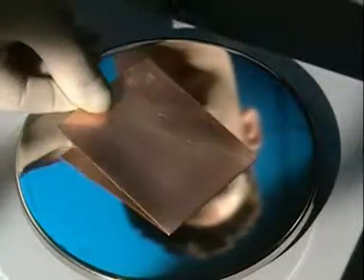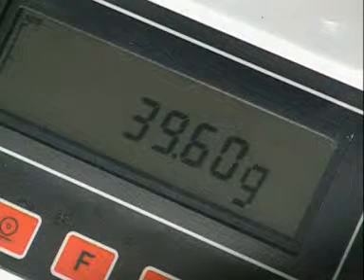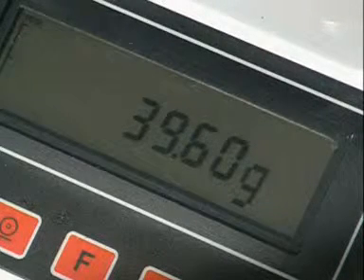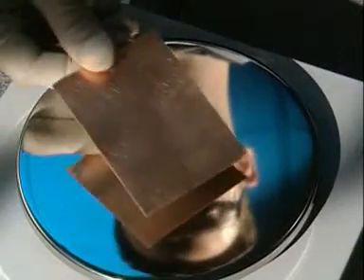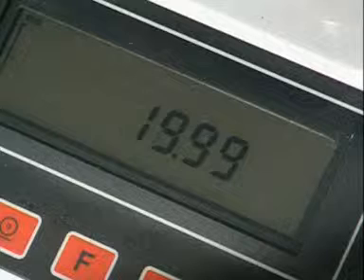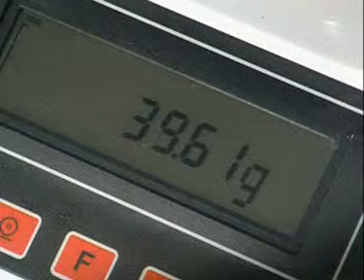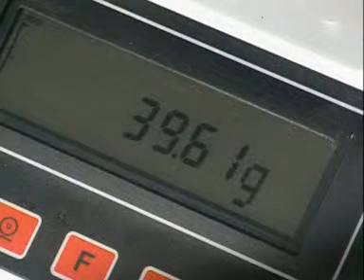This is going to be the positive electrode. It has a mass of 39.60 grams. The negative electrode has a mass of 39.61 grams. They're almost the same.